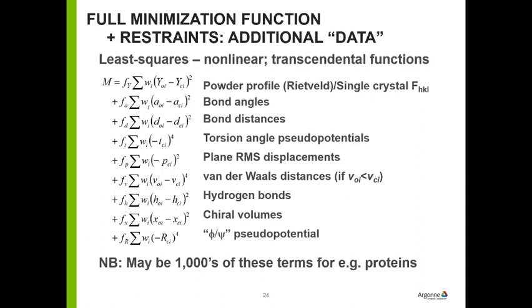This kind of stuff, by the way, is used by single crystal protein crystallographers to do their refinements of crystal structures, because there's a whole long list of things in which they know what the structures are, and they can use that information. Because after all, they're only dealing with 20 amino acids, and so they know what those are supposed to look like.